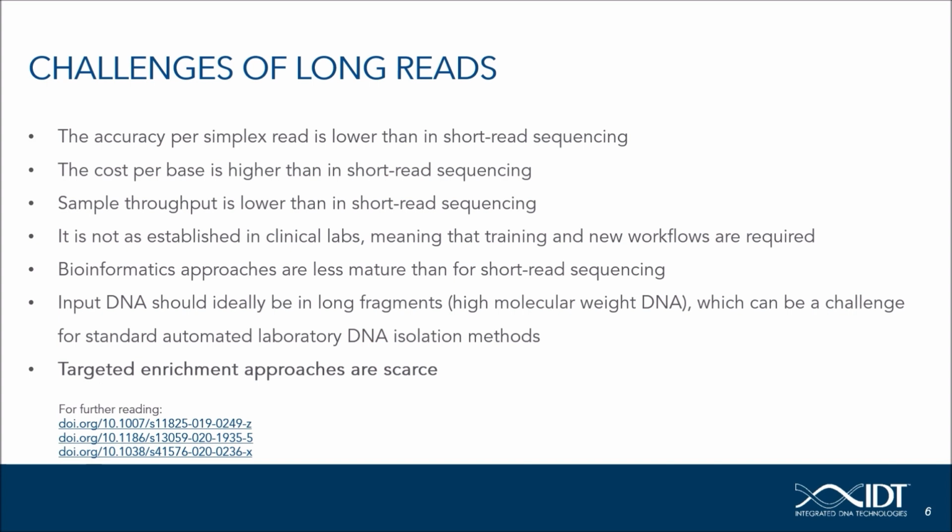So I mentioned the benefits of long-read sequencing, followed by two examples. Still, challenges remain. For example, the accuracy per third generation sequencing read is still lower than in short read sequencing. Next, the cost per base is also still higher than in short read sequencing. And also the sample throughput is lower. It is not that well established in clinical labs, meaning that training and new workflows are often required.